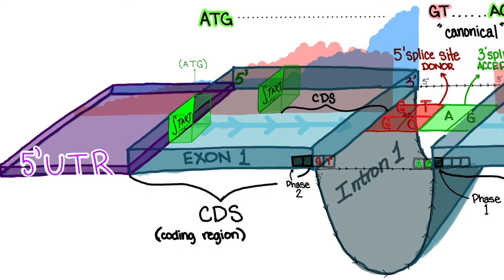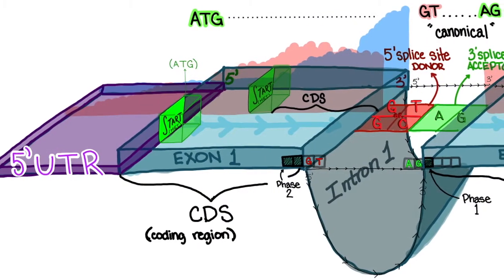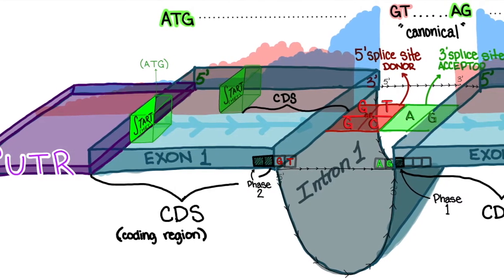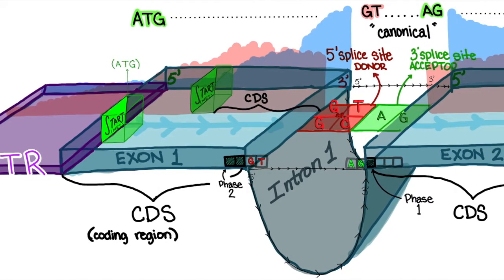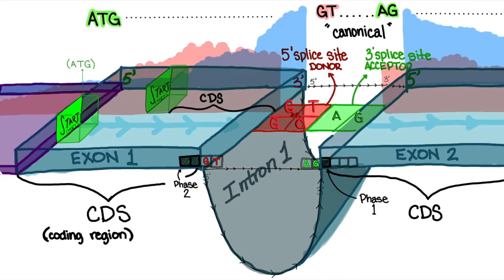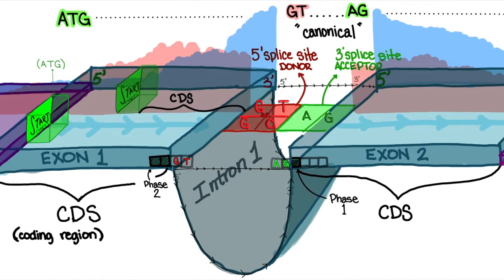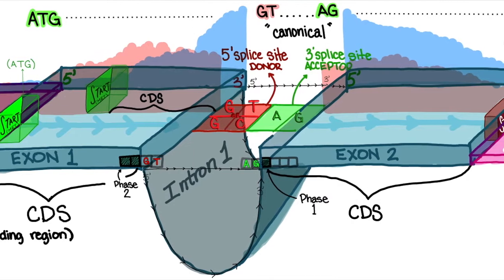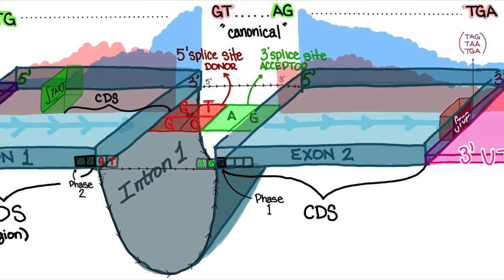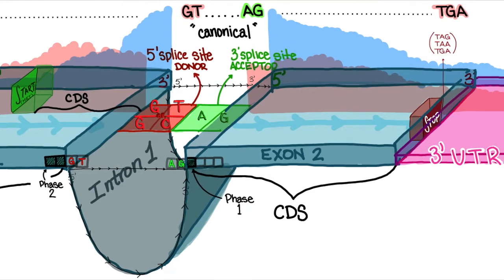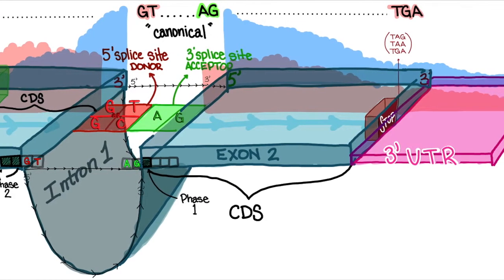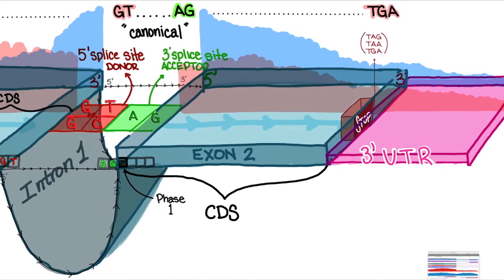Recall that the processed messenger RNA being aligned to the genomic DNA is only composed of the exons, which includes the untranslated regions, but not the introns — the sequences that get spliced out of the transcript. These sequences will not be present in the mRNA fragments when we align them to the genomic DNA, causing this characteristic sharp drop in data indicative of an exon-intron junction.